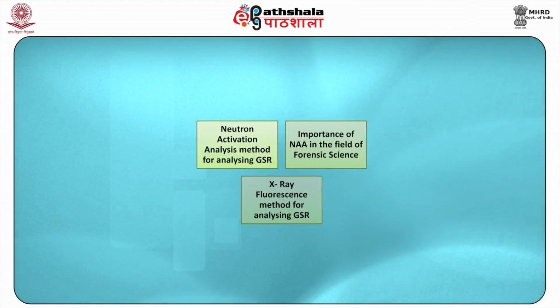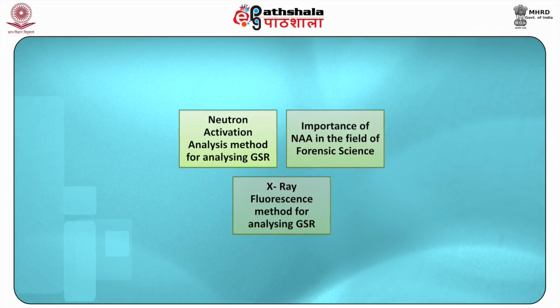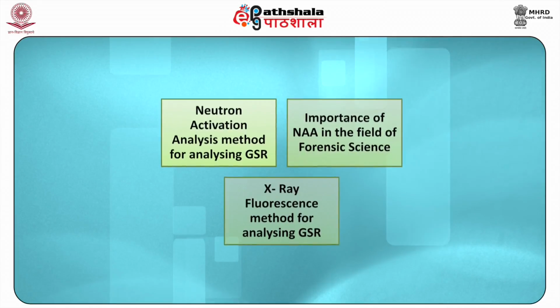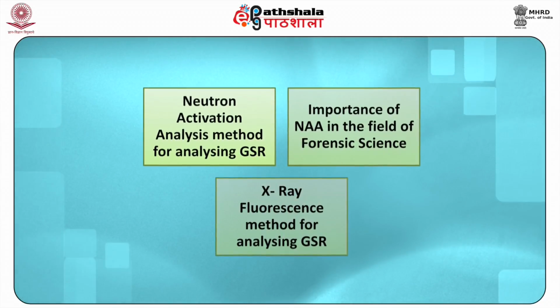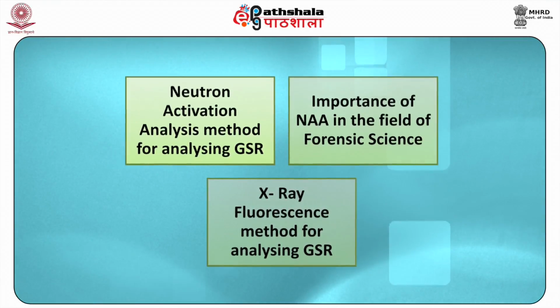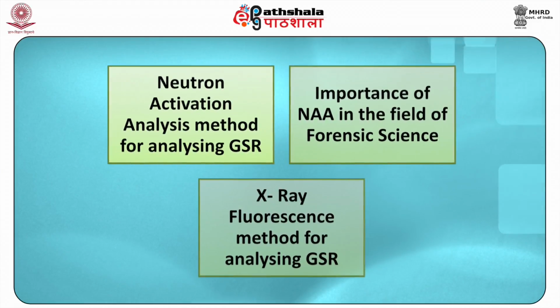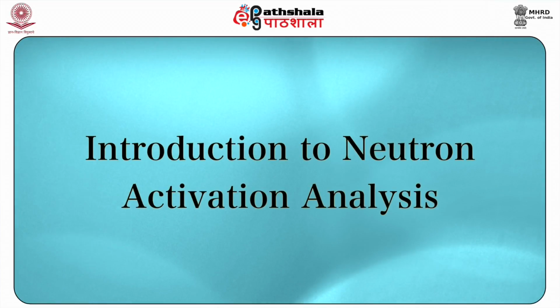After studying this module, you shall be able to know about the neutron activation analysis method for analyzing GSR, about the importance of NAA in the field of forensic science, and about the X-ray fluorescence method for analyzing GSR. Introduction to neutron activation analysis.